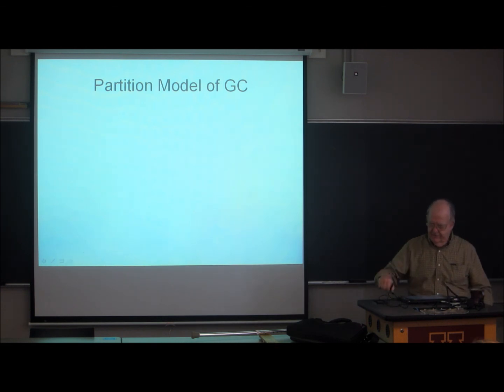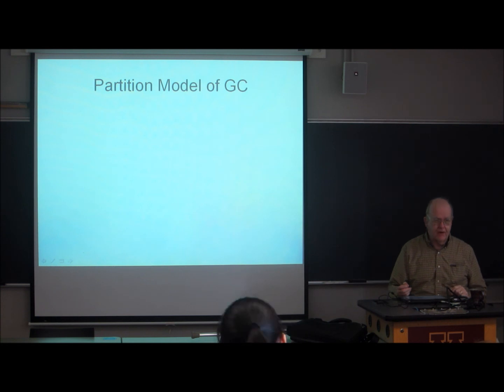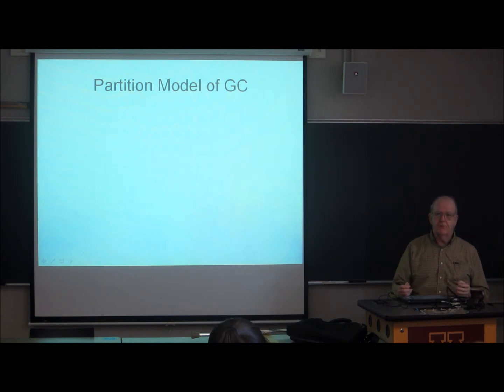Okay, so we're going to leave the practical world for a little bit and attempt to understand, at a molecular level, retention in gas chromatography. And we're going to start with the simplest model of gas chromatography.